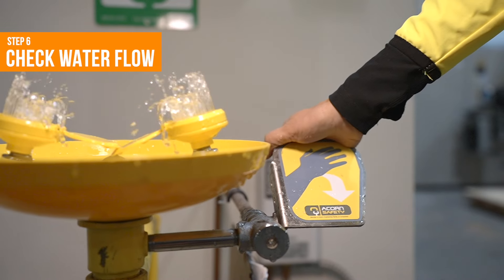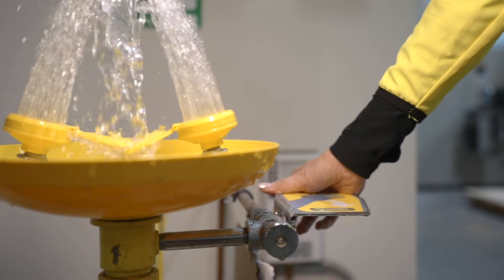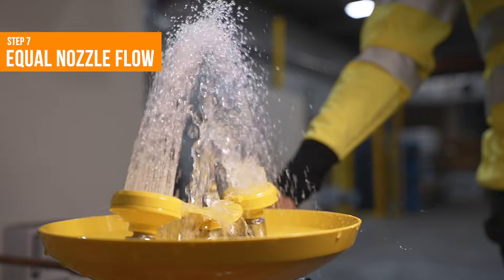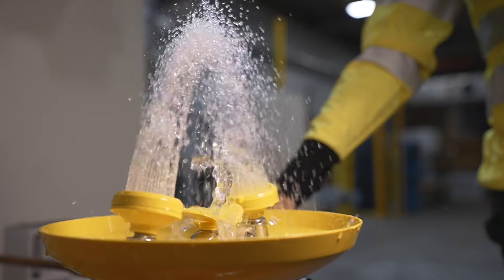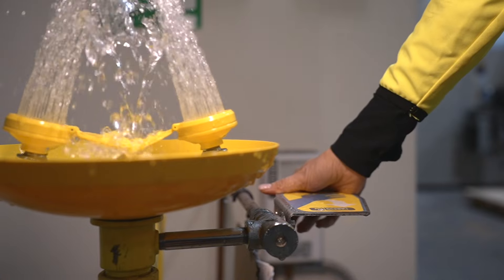Step 6: Check that the water flows within one second of activation. Step 7: If it's a dual stream eyewash like this one, make sure both streams rise equally to flush both eyes simultaneously.